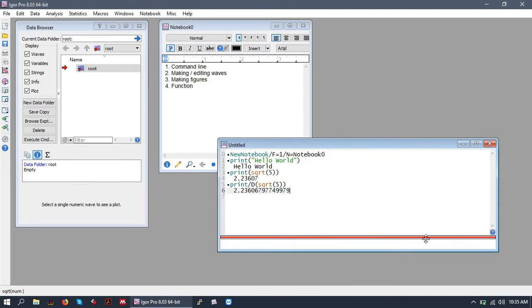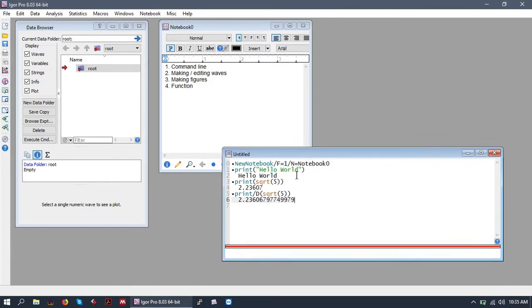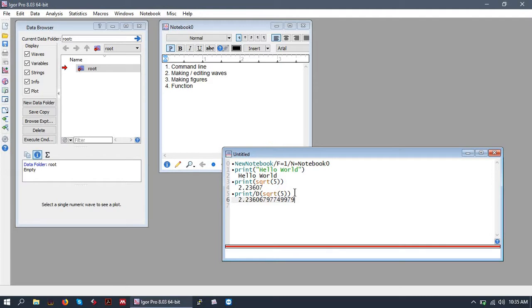Command prompt is your friend because it keeps a history of all the different operations you do in Igor. And if you're doing something through the graphical user interface, Igor will generally print that operation in the command line. So in the future, you can program it yourself. So when you're doing a lot of things in Igor, pay attention to the command prompt and you'll probably learn how to code that way.